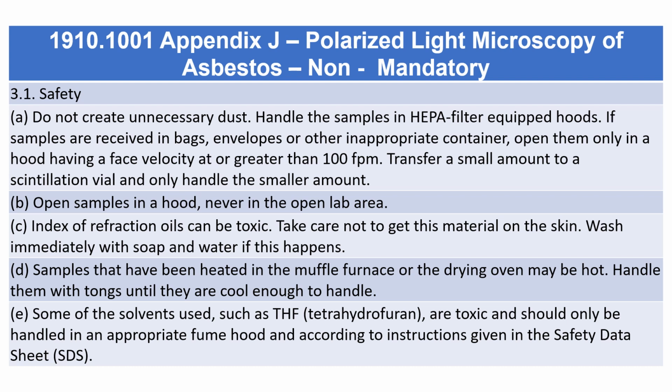C. Index of refraction oils can be toxic. Take care not to get this material on the skin. Wash immediately with soap and water if this happens. D. Samples that have been heated in the muffle furnace or the drying oven may be hot. Handle them with tongs until they are cool enough to handle.